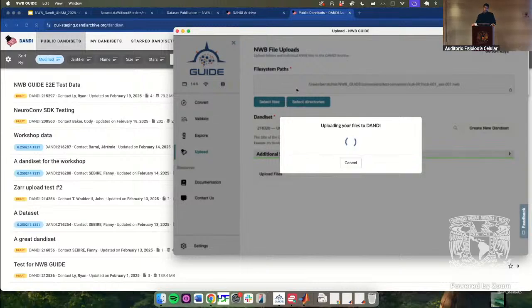And it also gets tricky if you have data sets that are continuous. Like, we recorded for 2 weeks. Is that one session? Technically, I guess, but sometimes it's easier to separate by day. So you need to upload session by session? No, you can select the whole directory. I just only had one for the test.